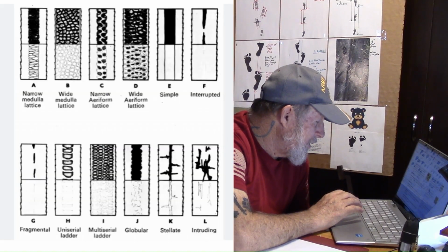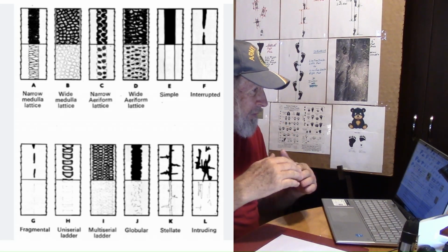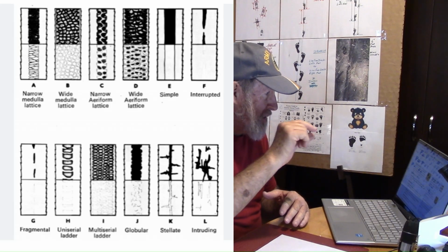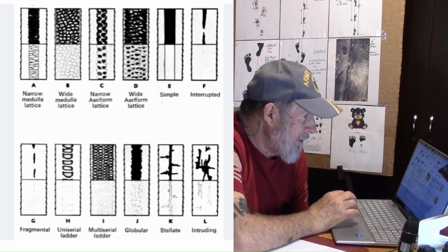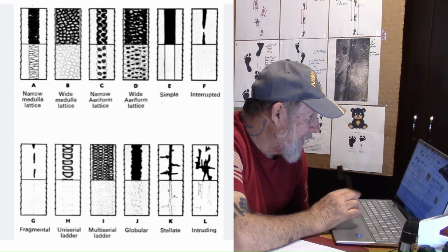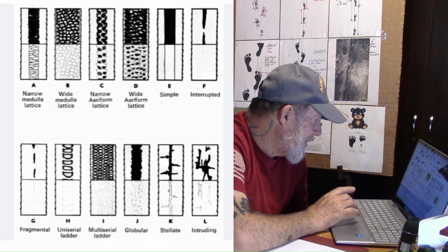Alright, so unlike human hair, which often lacks a medulla, bear hair typically has one, but it can be uniserial ladder, which is kind of instead of a straight continuous, it's got a ladder shape to it. I'll show a sample here also so you can see the absent medulla, the fragmented, the ladder type. It shows all these, so you can see what I'm talking about with the ladder. Interrupted or even absent, even within the same bear. So the same bear, depending on where the hairs are, can have a medulla and can not have a medulla.